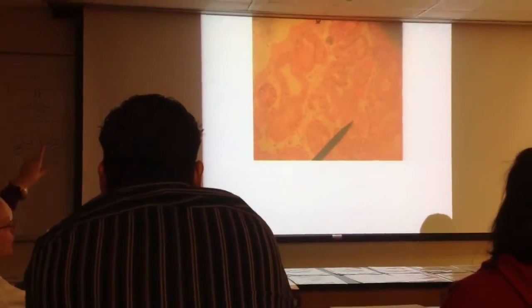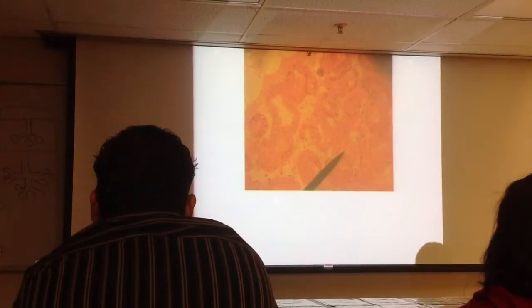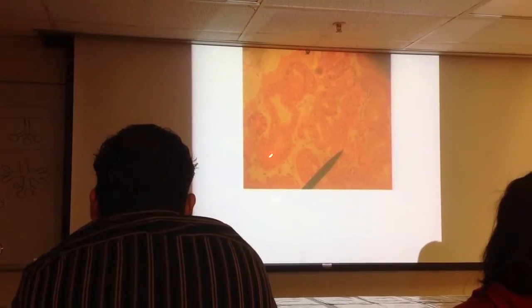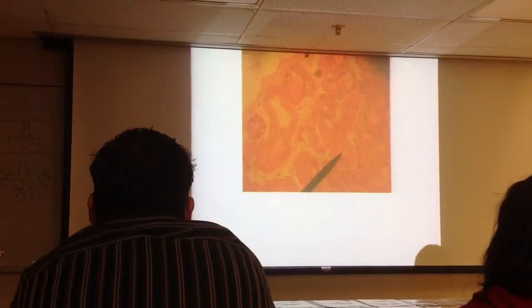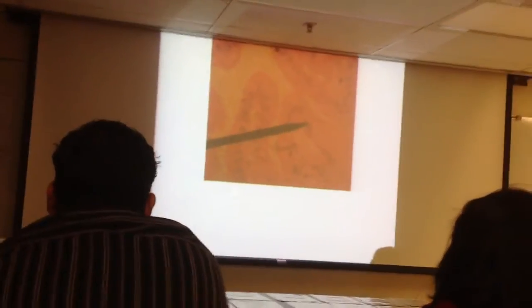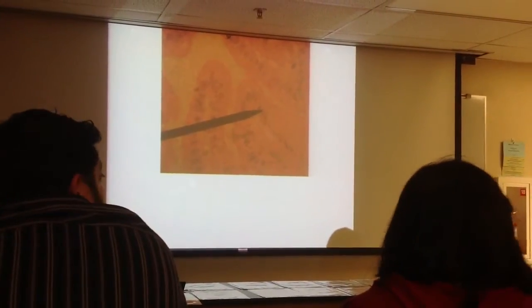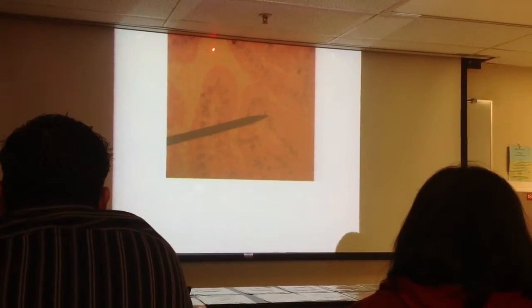And remember, I have the low power on my picture and then the higher on the low. What organ is this? Sweat gland. What type of tissue? Stratified cuboidal ET. Okay. And basement membrane and stuff. Sorry, I didn't mean to take it off that soon, but I didn't have the other one up. Okay. What's this? Lumen.